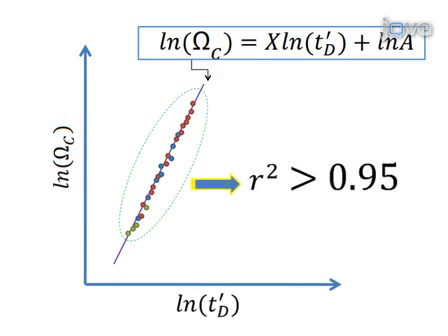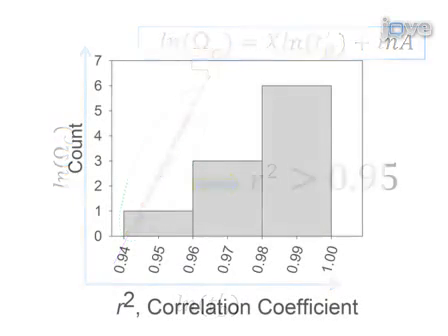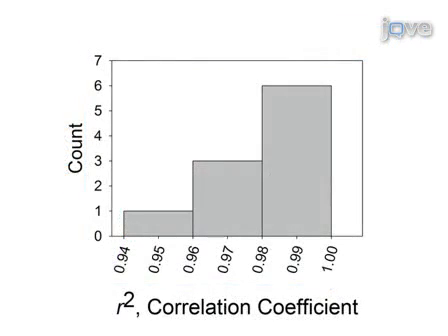A lower correlation coefficient value may be due to incomplete unfolding of the protein calibrants, aging of the sample, dissimilar experimental conditions used for the different calibrant proteins, noisy spectrum, and incomplete processing of data or calculation error.